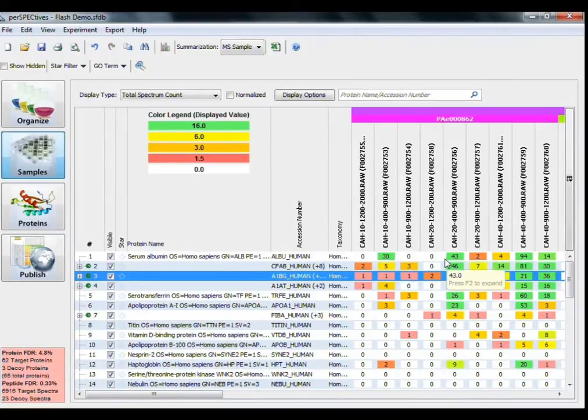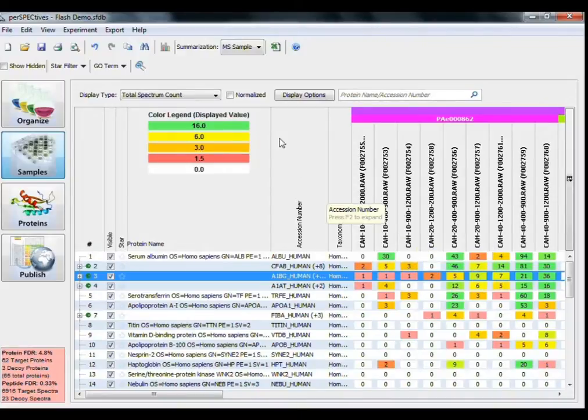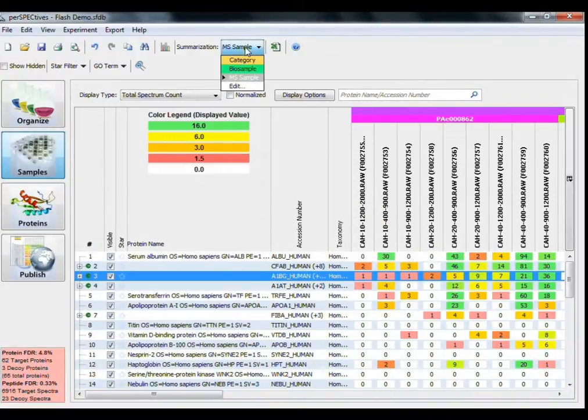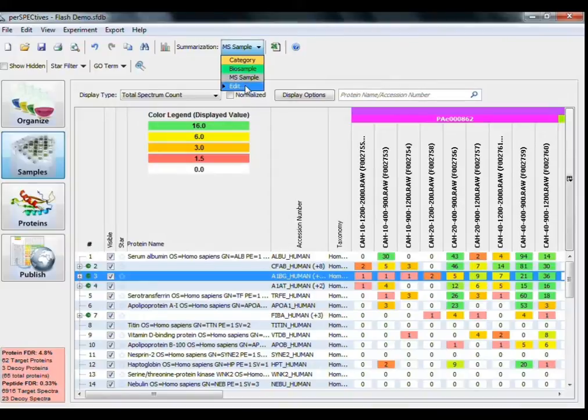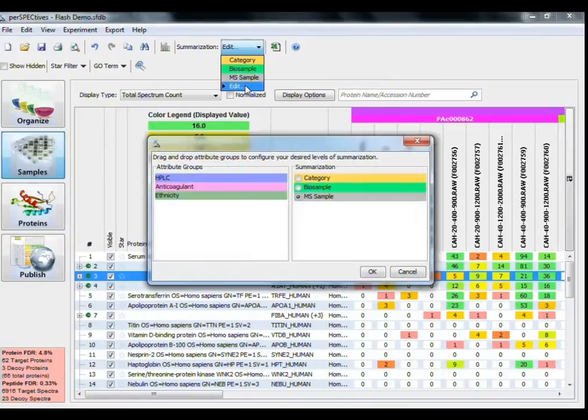You can customize the summarization tree structure of the experiment, depending on how you want to examine your data. Click on the Summarization button at the top of the program to pull up the Summarization drop-down menu. Click Edit to change the tree structure.